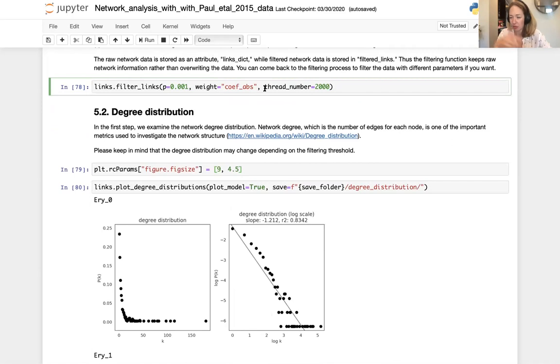Certainly with the networks we've inferred, we see these linear relationships in the degree distribution. So I think the safe assumption is these should be scale-free networks because they most commonly are in biological systems. If you don't see this linear relationship, go back to these thresholds and really assess: have you been too lenient? Can you change these?